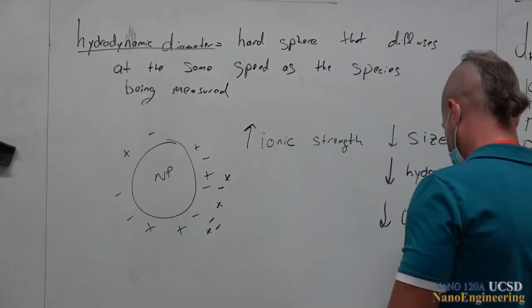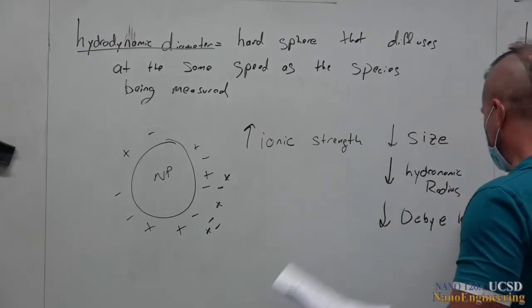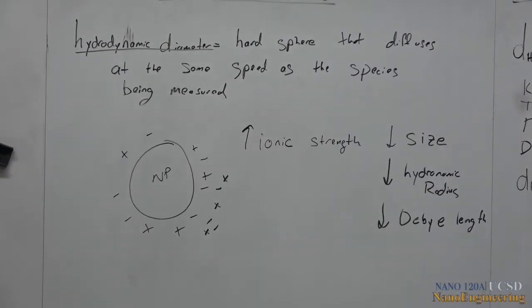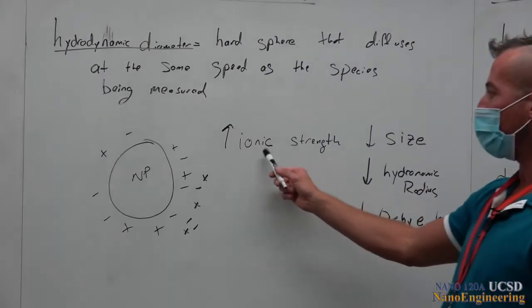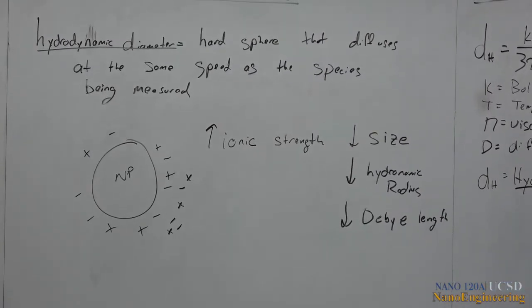lower Debye length. Is that how you spell Debye? Yes. Lower Debye length. So picking your salt concentration is kind of important. Okay?